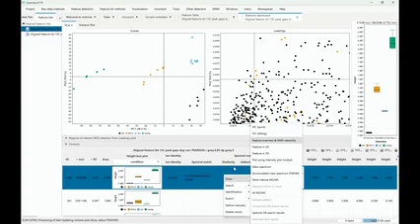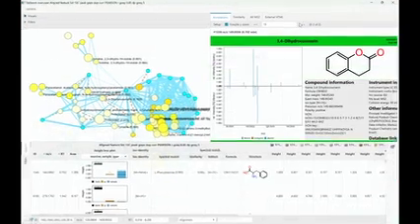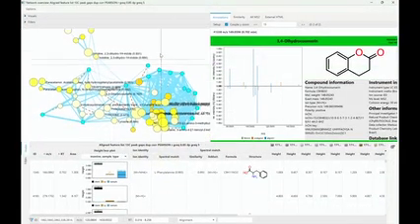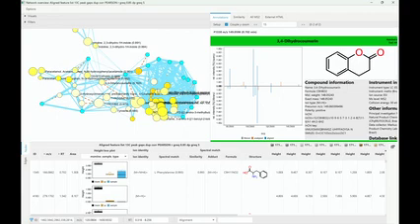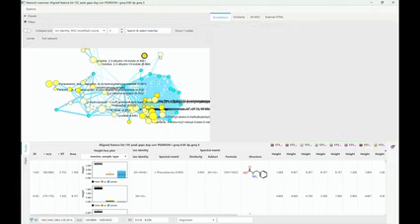And this feature overview, again, combines many different aspects. I can tell you, very often those things look quite dense because of the relationships in your data set, there's a lot of different amino acids, there's a lot of different peptide breakdown products and so on. It kind of depends on the data set you're looking at, but there's a lot of spectral similarity within your samples, right? So the blue lines, the blue edges are connecting features, and they're connecting them by spectral similarity.